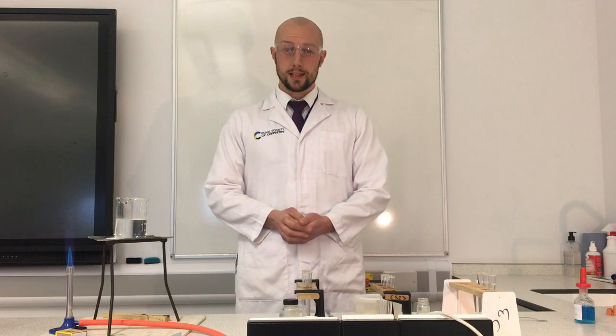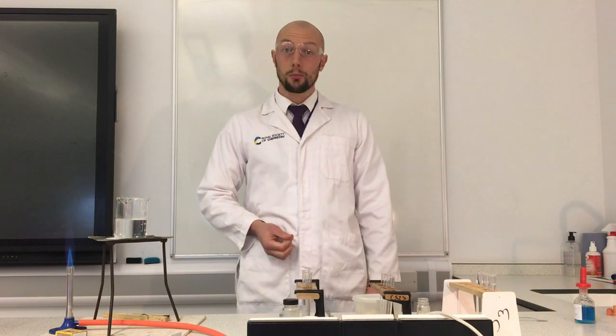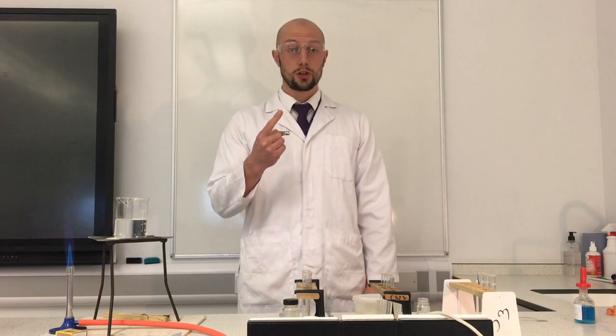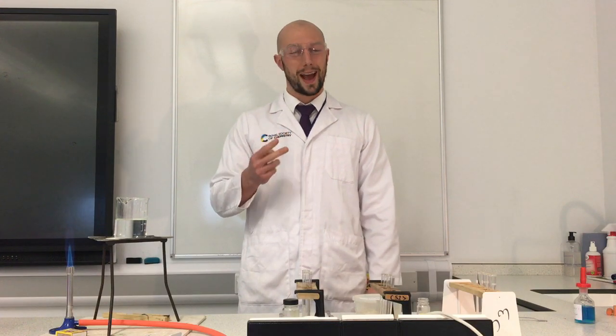A food test is where we take a food and we test to see what nutrients it has in it. Today I'm going to do tests for 3 different nutrients. Starch, which is a type of carbohydrate, glucose, which is also a type of carbohydrate, and fat.